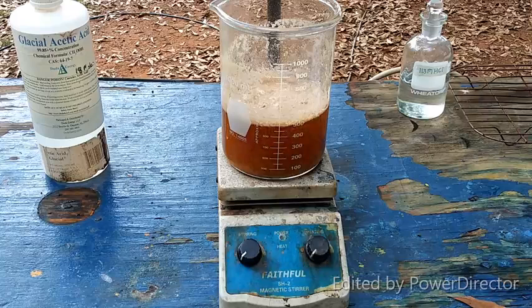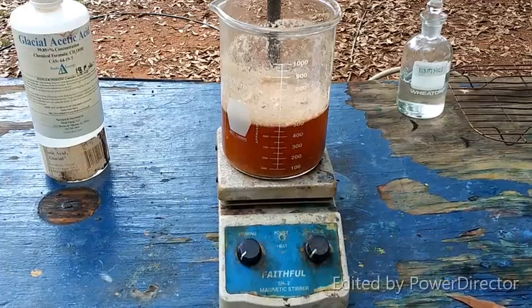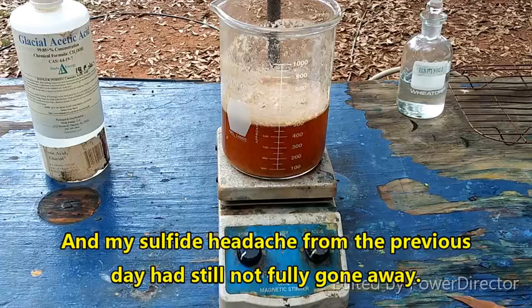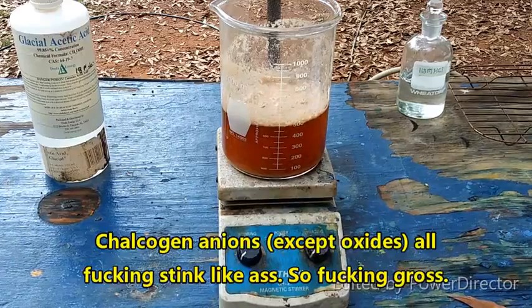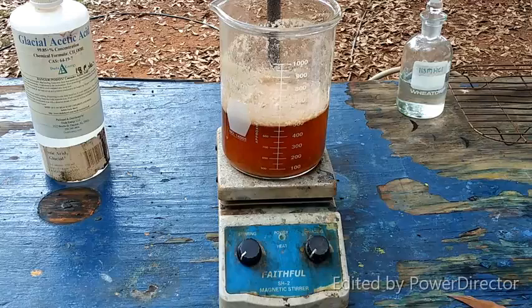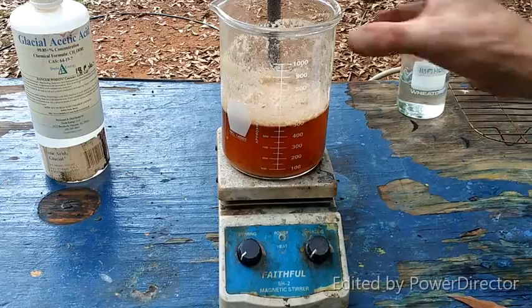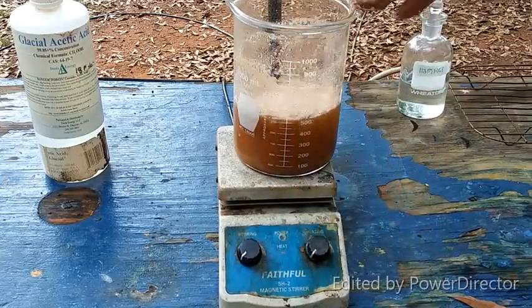I don't know. I may do the recovery of the filtrate as a separate video because it's getting to be late in the afternoon and it's really hot and humid out here. Plus, it looks like it might rain soon. And, I mean, I did that yesterday, and the smell of sulfide, I can only take so much, man. It's still lingering around here. It's terrible. Anyway, I will come back when I am ready to filter this bad boy. Man, there's a lot of it in there. That's pretty cool.